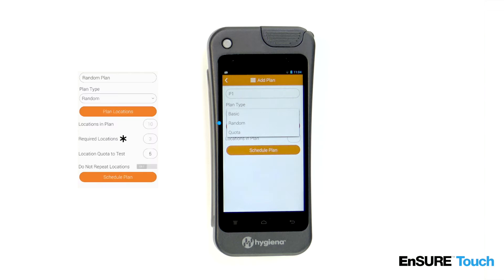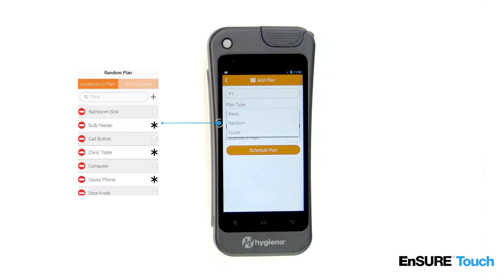For example, if a random plan has 10 locations with a quota of 5, then 5 locations will be randomly selected from the 10. You also have the option to specify required locations, which means that those locations get selected every time.